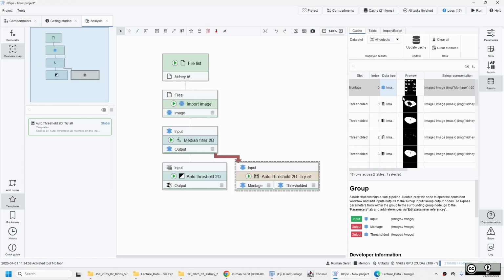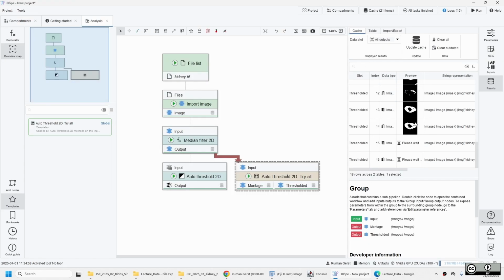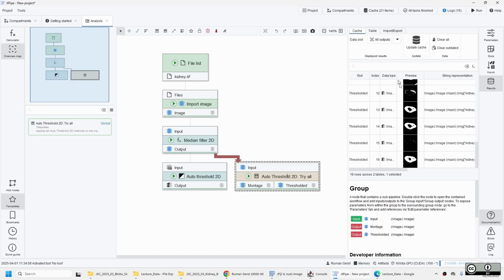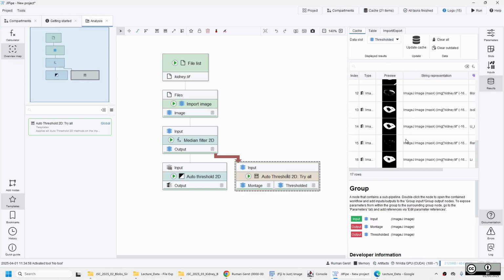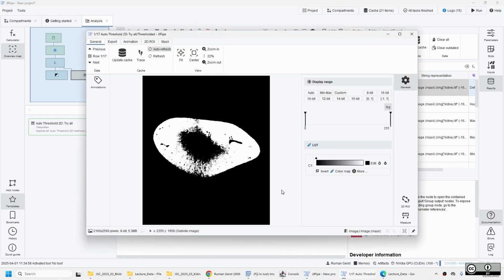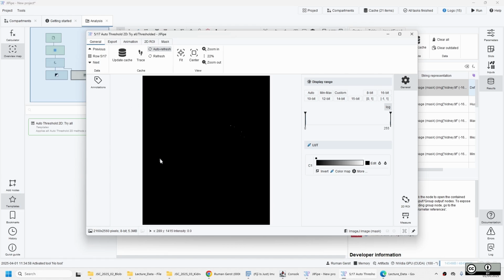And then you get now these thresholded results, and you get one for each threshold. It's in this other output, in this thresholded output. So here they are as is. And then you can just open them up. And this is why there's this JIPipe viewer. Here you can just browse to them. You can just go here at the top left, next, browse to them in JIPipe directly.